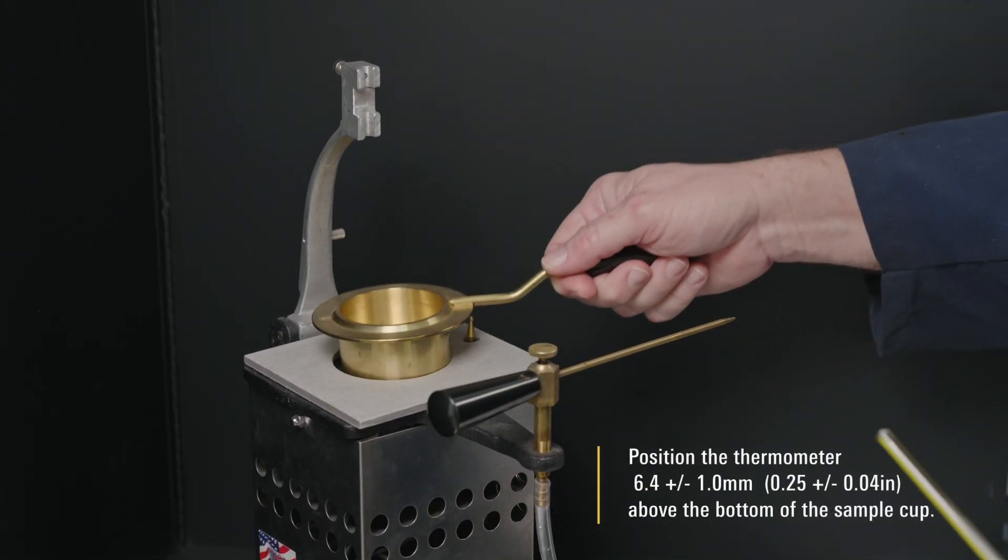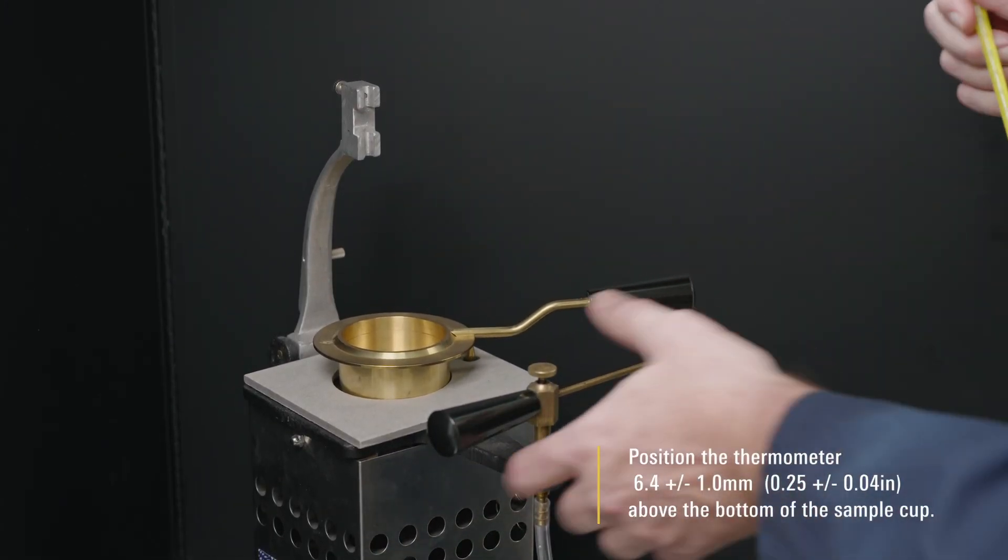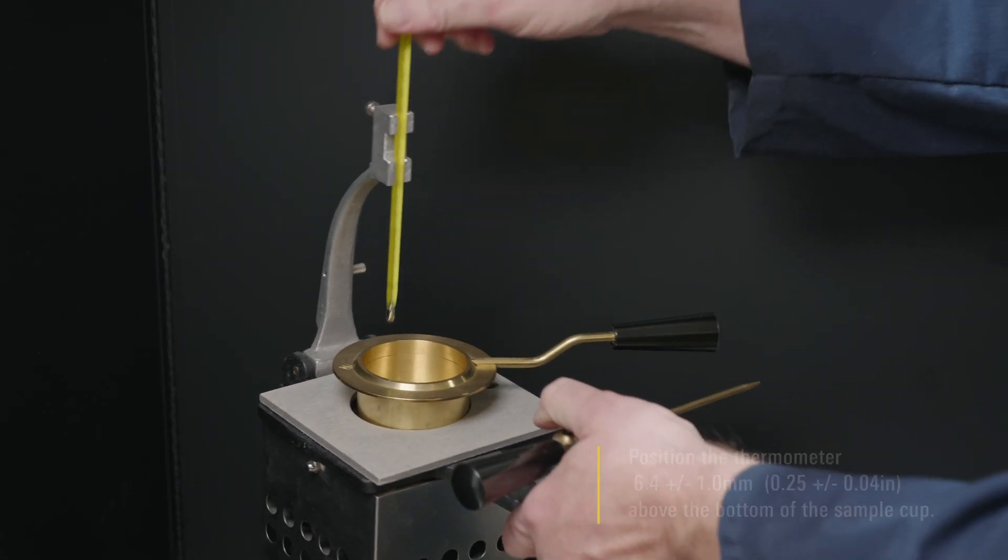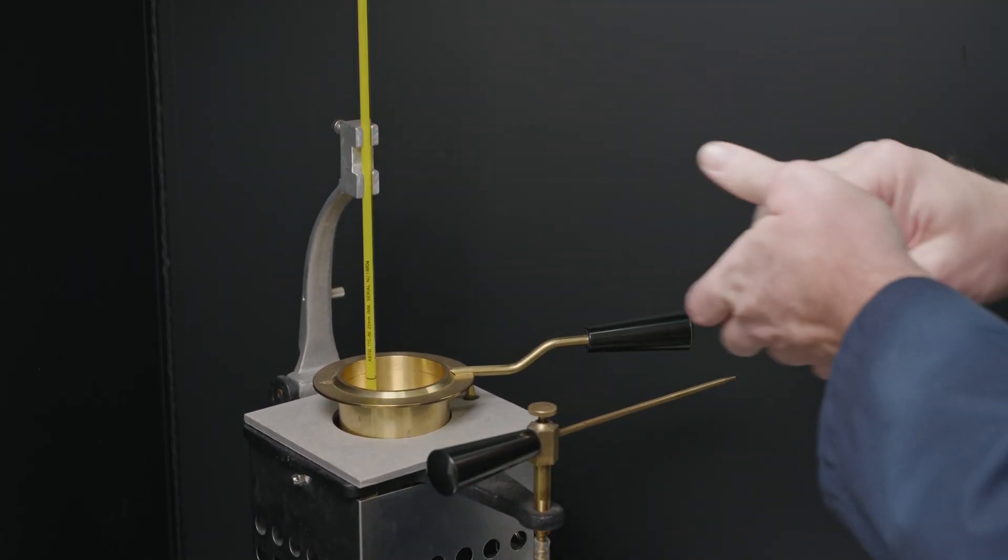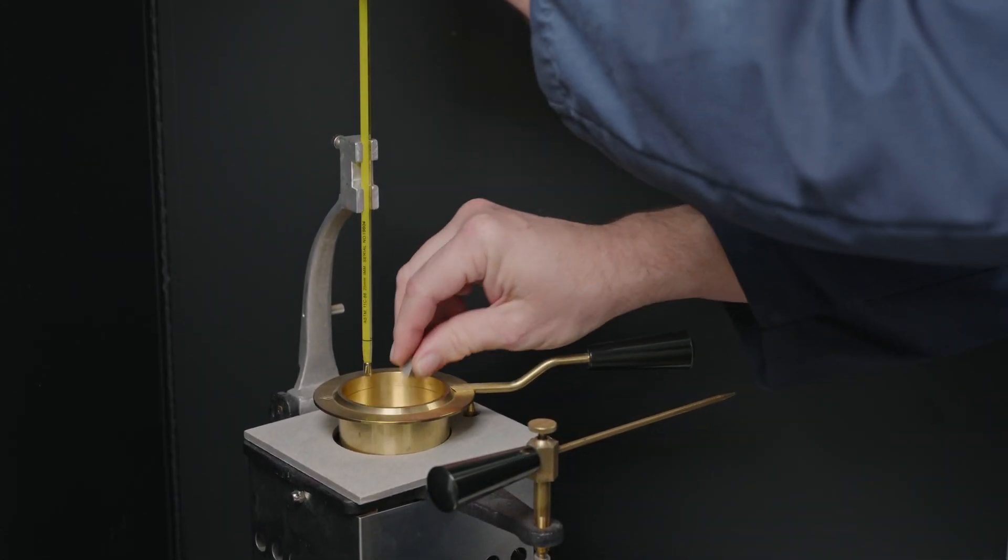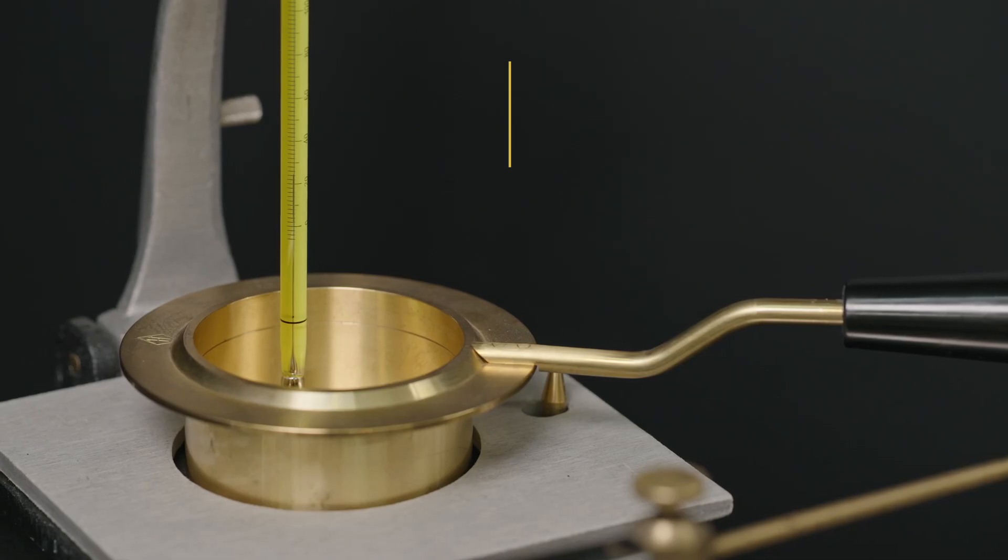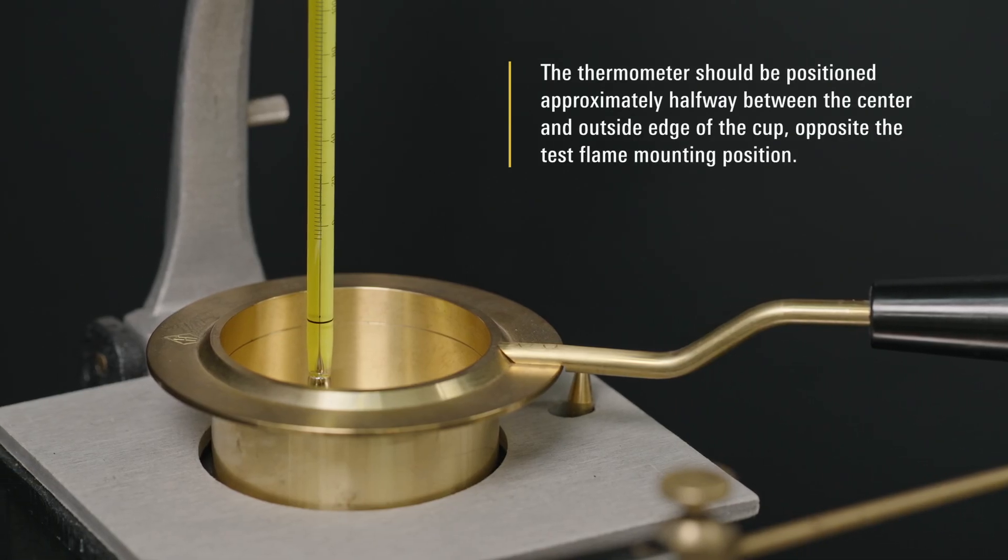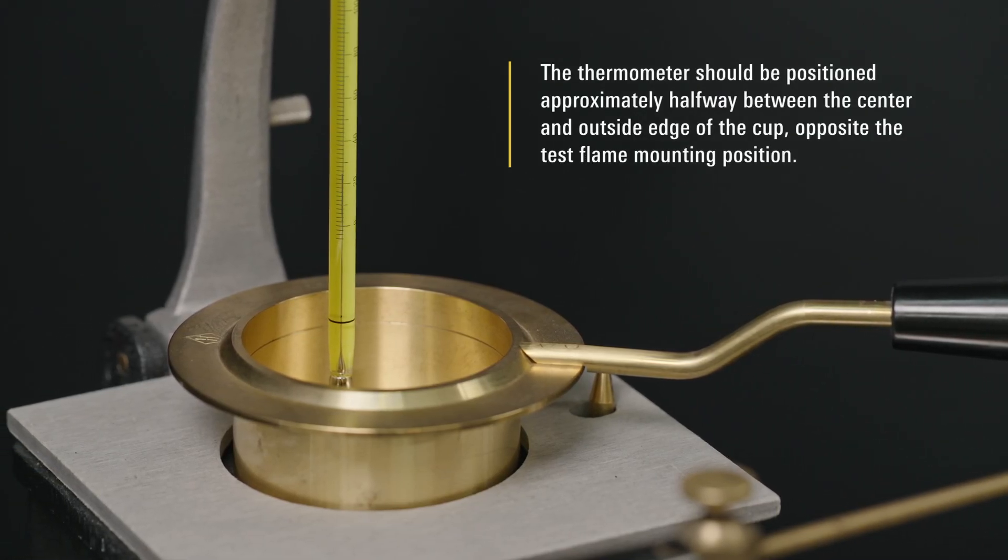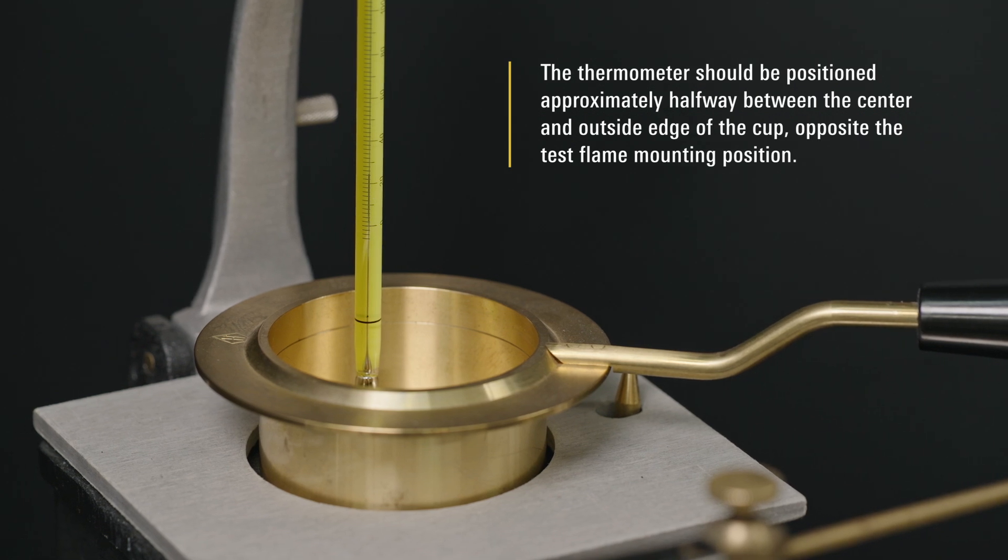Position the thermometer 6.4 ± 1 mm above the bottom of the sample cup. A BBR mold end piece is a useful shim to set this depth. The thermometer should be positioned approximately halfway between the center and outside edge of the cup, opposite the test flame mounting position.